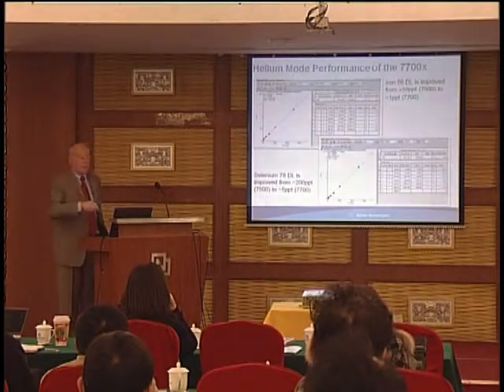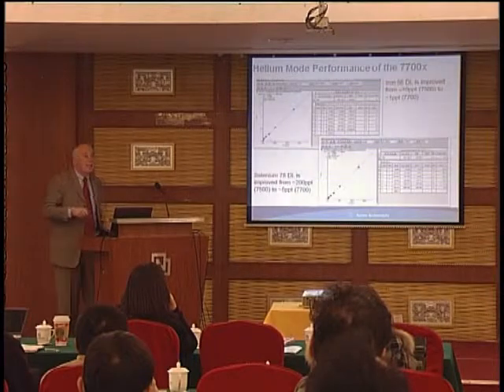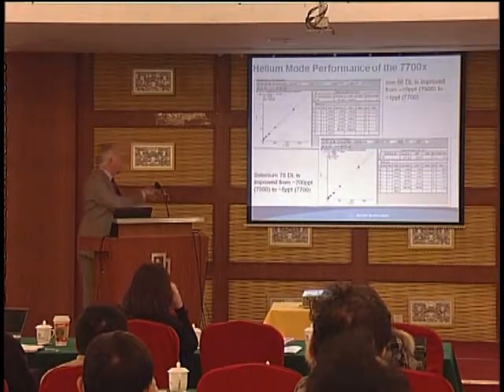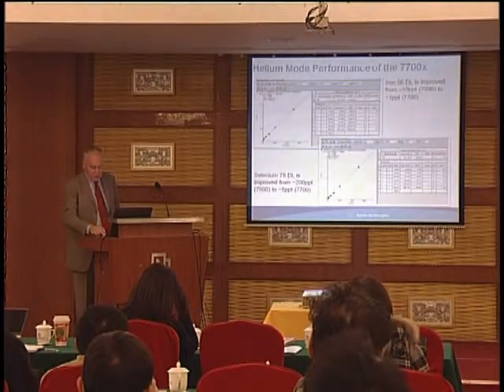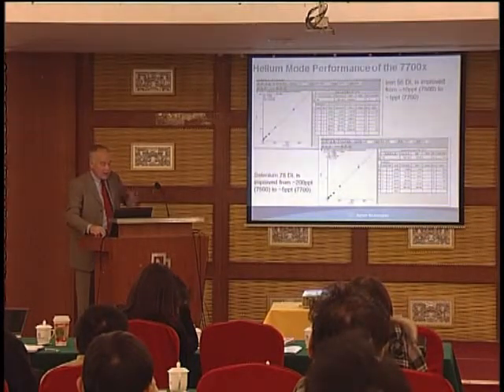Another problematic element is selenium. The previous version instrument detection limits for selenium were around 200 ppt. Now they're down to about 5 ppt. So again, just much more efficient collision mode using higher energy.